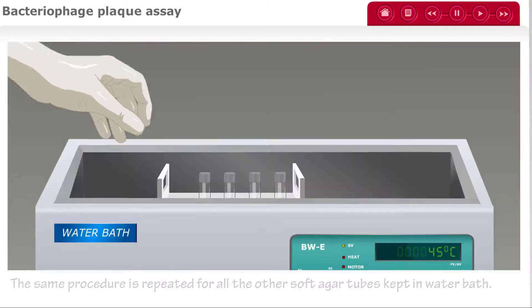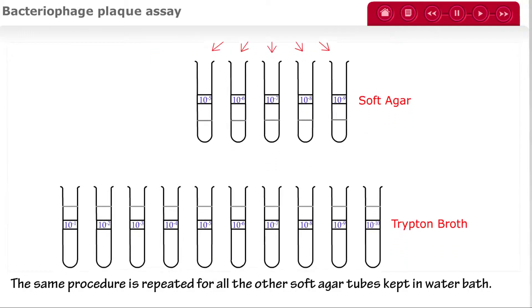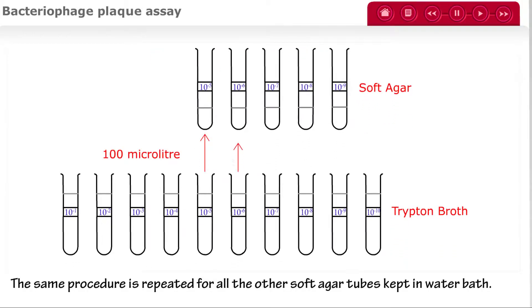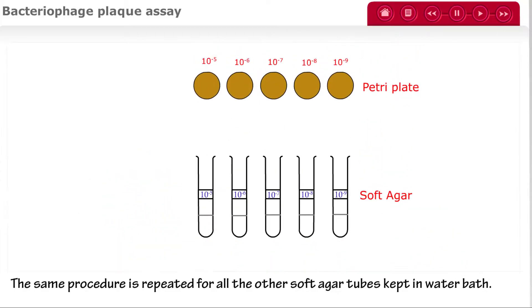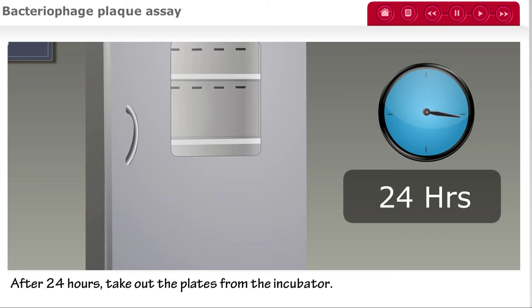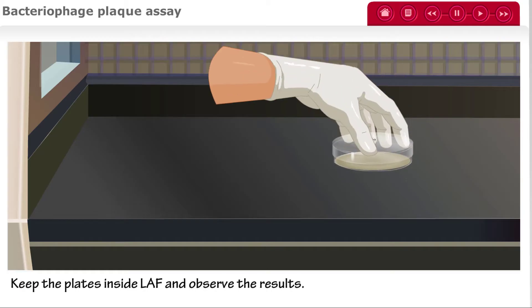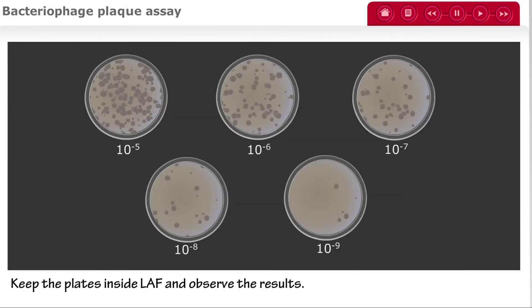The same procedure is repeated for all of the other soft agar tubes kept in the water bath. Two to three drops of E. coli are added to each soft agar tube at different concentrations. Then 100 microliters is transferred from the tryptone broth to each soft agar tube. Each soft agar tube is poured onto its own properly labeled petri plate. Then all petri plate cultures are incubated for 24 hours. After 24 hours, take out the plates from the incubator and observe the results inside the hood. You should notice that the more dilute samples yield fewer plaques.